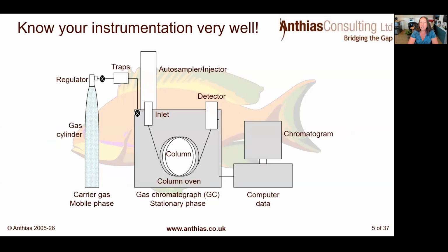So now we've identified and pulled some information together. There could be quite a lot of different problems in that. But the main way you're going to solve that problem is to really know your instrumentation to start with.